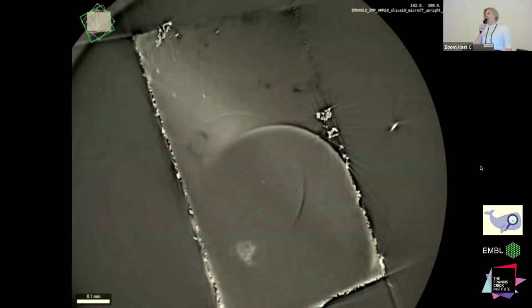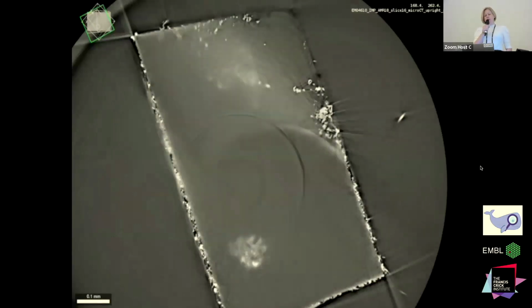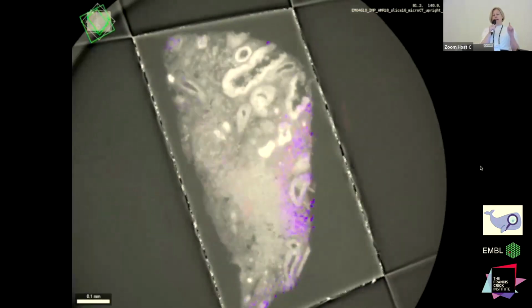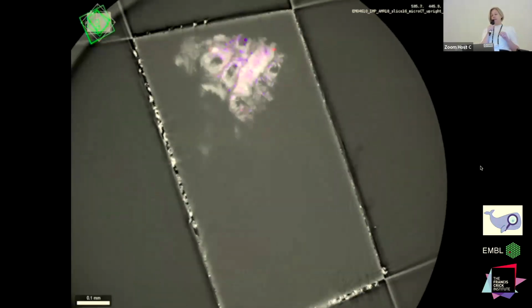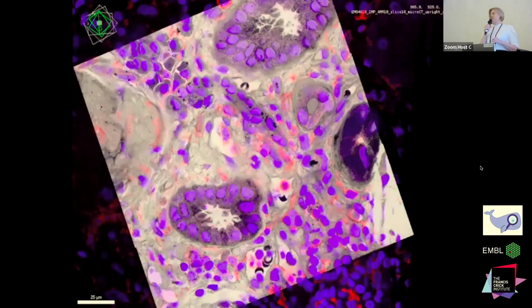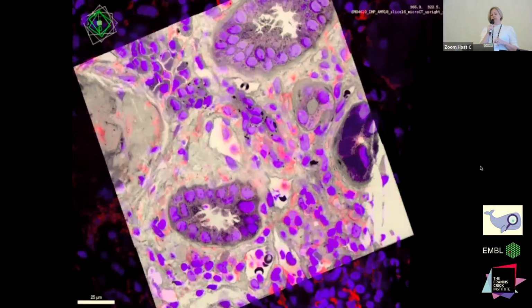So this is something called MoBIE, developed at EMBL Heidelberg by Christian Tischer and his team. And so what you're looking at here is scrolling through the X-ray data, which was collected at the synchrotron in Hamburg. So we can image both hydrated biopsies and resin-embedded biopsies extremely quickly in 2.5 minutes, including the data reconstruction.